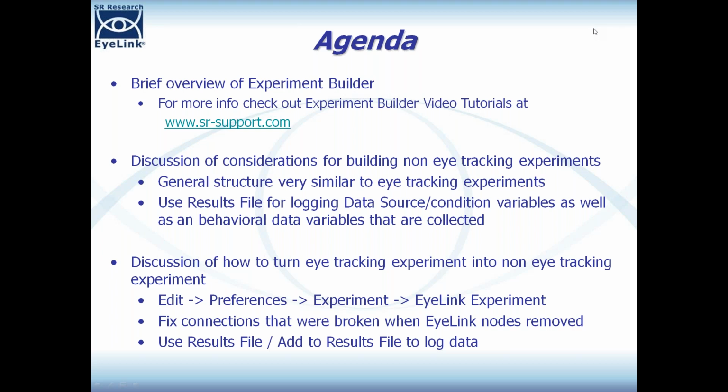Then we'll quickly talk about the considerations that you need to keep in mind when you're building non-eye tracking experiments. In general, non-eye tracking experiments are very similar to eye tracking experiments, but obviously you're not going to be able to use the EyeLink-specific nodes in a non-eye tracking experiment. That doesn't really make any sense. So we'll talk about that stuff.